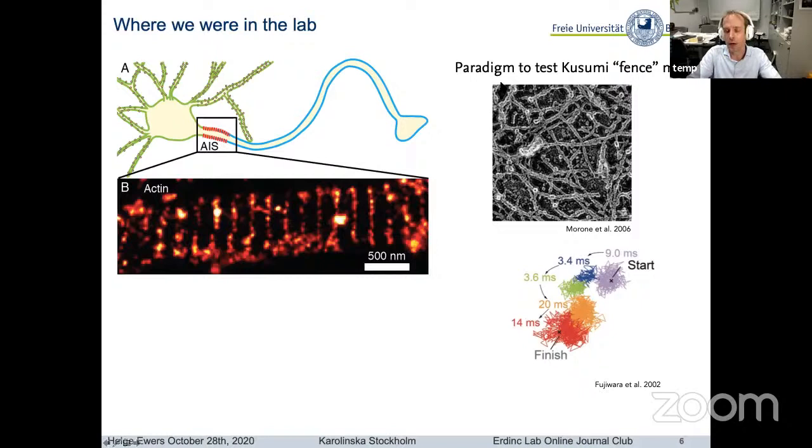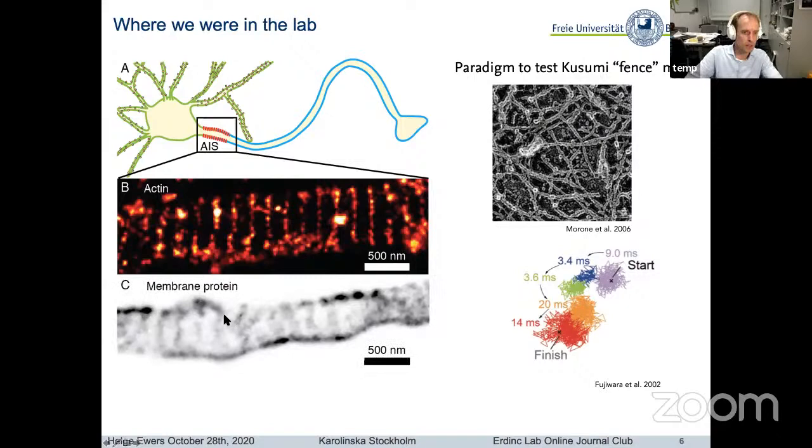So here we now have these rings that are persistent over longer time, and we were hopeful to correlate that structure to the motion of membrane proteins, and we could indeed do this. Here you can see single-particle tracking data of lipid-anchored GFP, GPI-GFP coupled to quantum dots, and we could localize, indeed, that these stripes are right between these actin rings. So the membrane protein diffuses between these actin rings and has a hard time in this picket model of jumping over that actin ring.